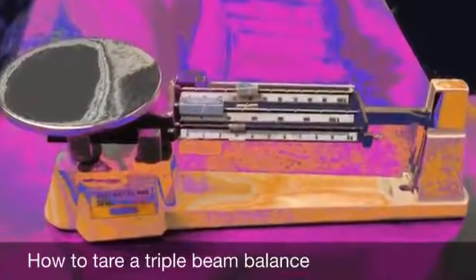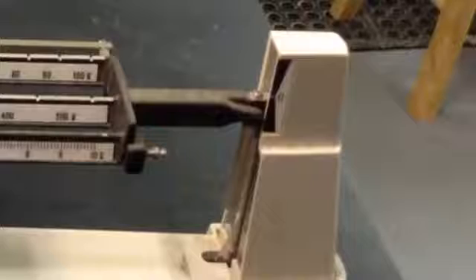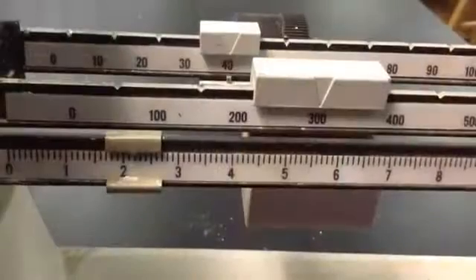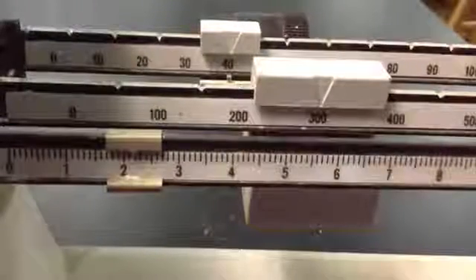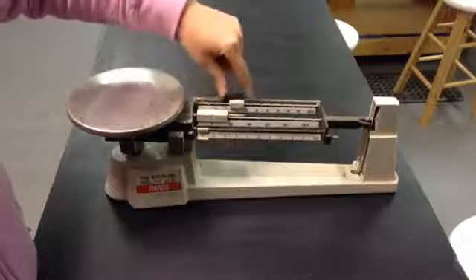How to tare a triple beam balance. This is the pan, this is the zero you want to line the beam up with. These are the three beams and the three riders. Slide all the riders all the way to the left of the beams before you start.